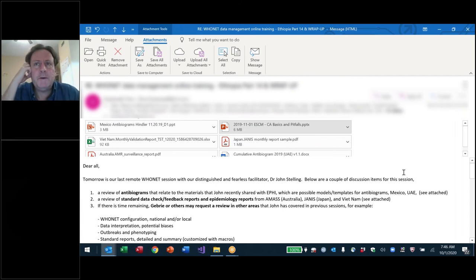So I'll now explain to you the lab, it's called the laboratory identified event. It's the laboratory approach to saying if this was possibly a hospital infection. It's what we call a proxy definition. It's what we call a surrogate definition. So the proxy definitions on average are usually right, but there will be exceptions to this. So what do I mean by this?